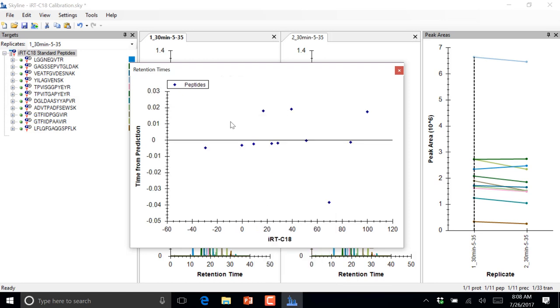And it still has residuals, and the reason is that we calibrated based on two things. So we actually ended up taking the averages of those, and unless we calibrated to one run, we're not going to get these residuals on this line. But it's really pretty close, right? It's a lot closer than the original standard values.